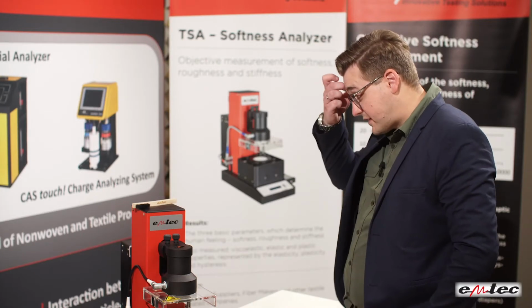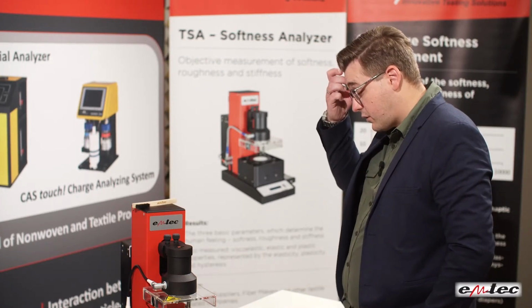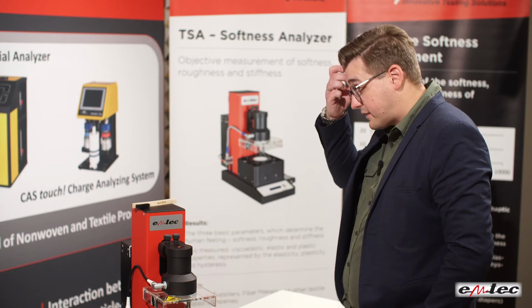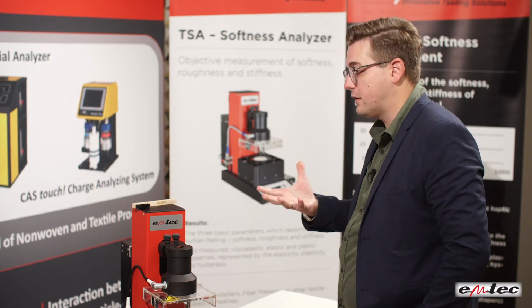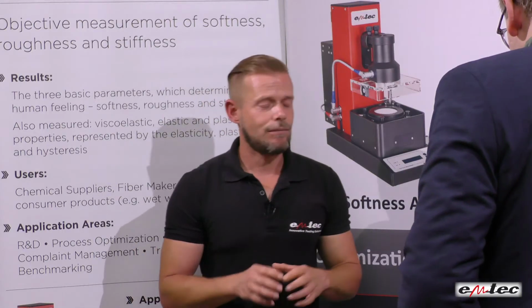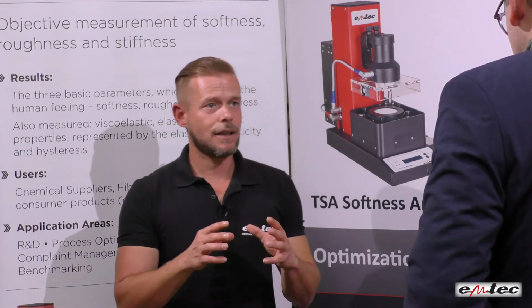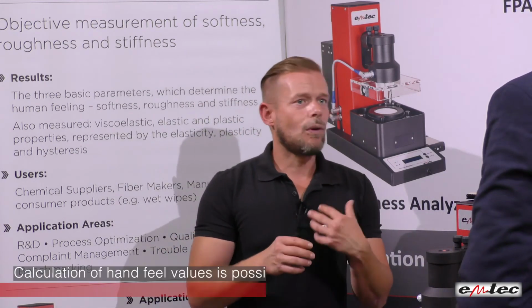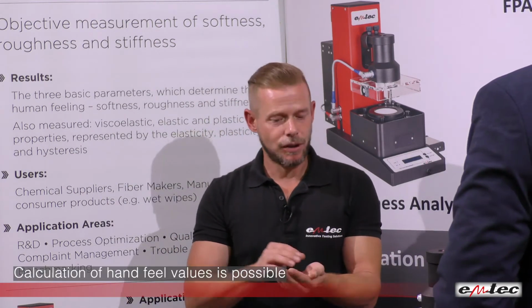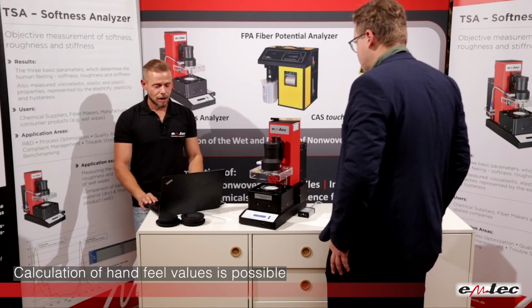Yes, this totally makes sense to have these parameters also available separately. But is there a possibility to have some information about an overall feeling? Yes, of course. We can calculate so-called hand feel values, which are like the overall impression of the haptic quality when a human touches something. So this can be done.